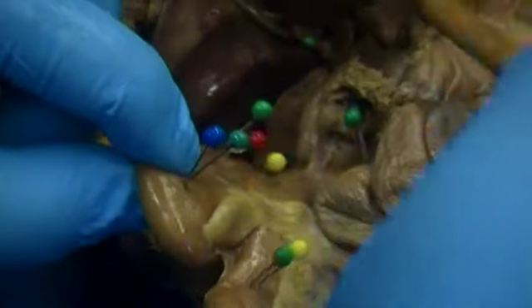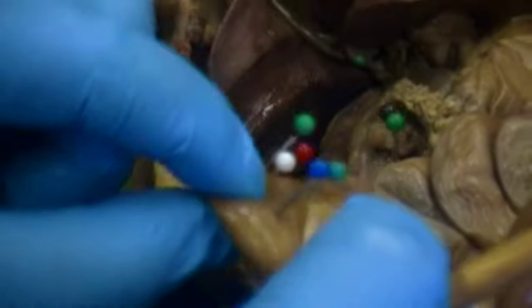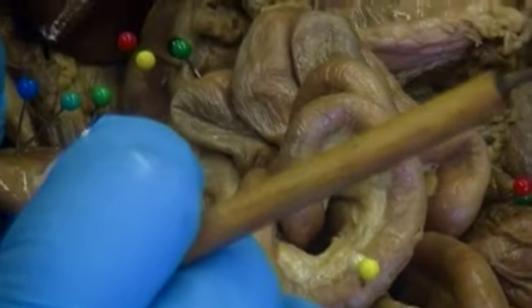The jejunum continues to wind and twist and turn, eventually connecting to the large intestine. You can see how much larger the large intestine is compared to the small intestine. This connecting structure, labeled with a green and yellow pin, is the ileum.